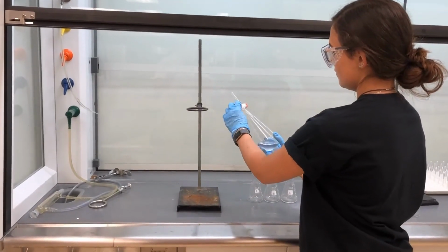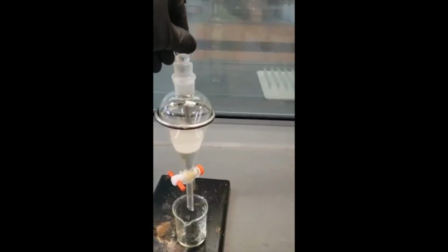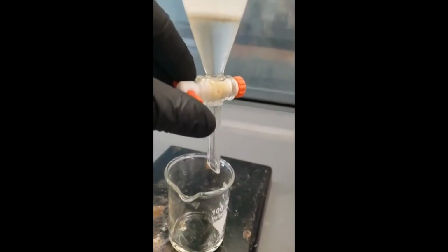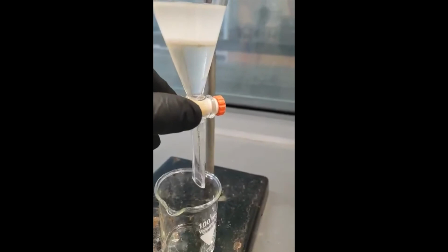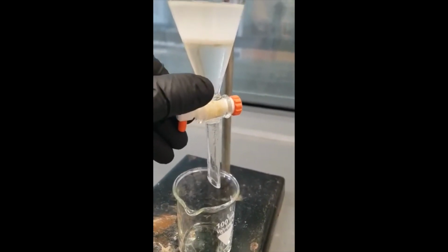Once the pressure is released, place the separatory funnel back on the metal ring clamp and wait for the layers to separate completely. You must first remove the top of your separatory funnel, and then you can drain the bottom layer into a beaker. Your bottom layer should be the organic layer, the methylene chloride that contains your essential oil.